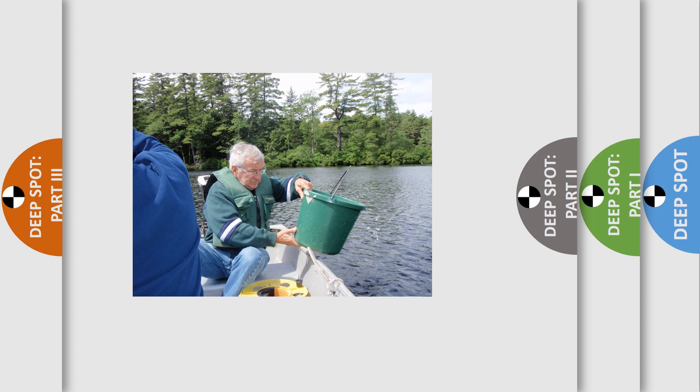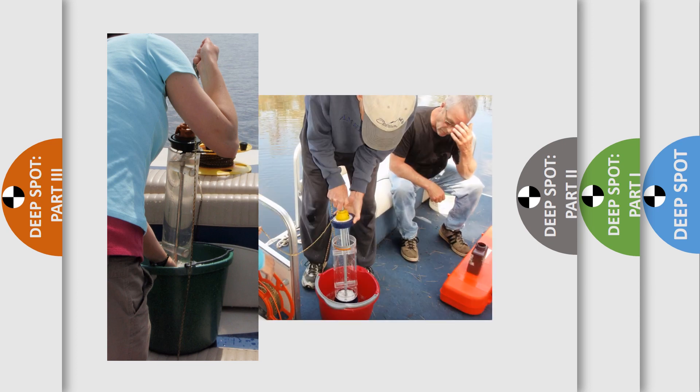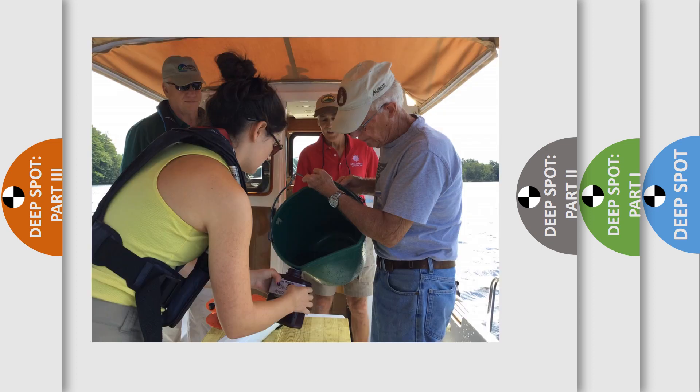Make sure you use a clean bucket. Rinse your bucket with lake water and discard. Lower the Kemmerer bottle to the appropriate depths and close the bottle. Empty the water from the Kemmerer bottle into the bucket from each meter to the surface. If not using a full Kemmerer bottle of water from each depth, make sure you use the same volume of water from each depth. Take your large brown bottle, rinse with water from the bucket and discard, then fill the brown bottle from the bucket and put it in the cooler.